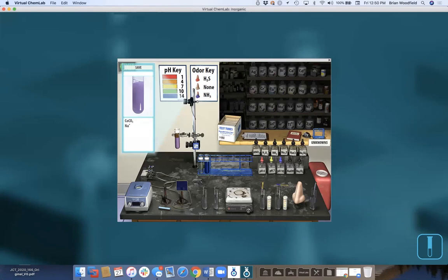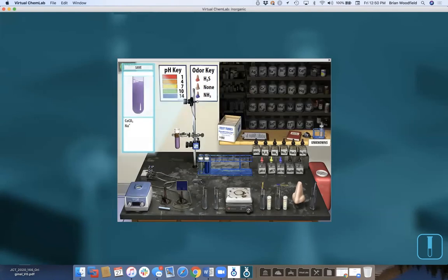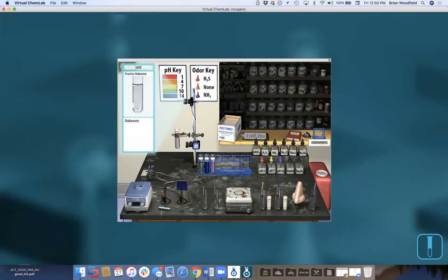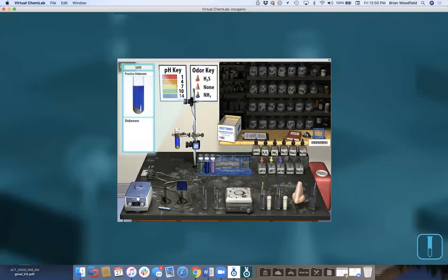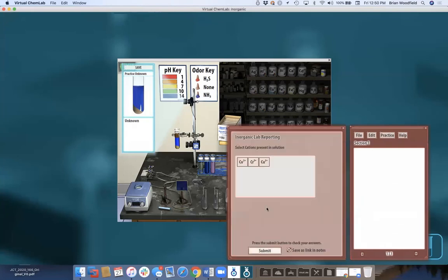Here's my unknown — I drag it out of the way, put it in, and go through my tests: add sodium hydroxide, centrifuge, and I know I don't have chromium. Add ammonia, centrifuge, and I know what I have. Go to my lab book. No chromium, I have cobalt and copper — submit. This is a practice unknown, so students can practice. We also have numbered unknowns and advanced unknowns through the clipboard that get reported in the lab book the same way.